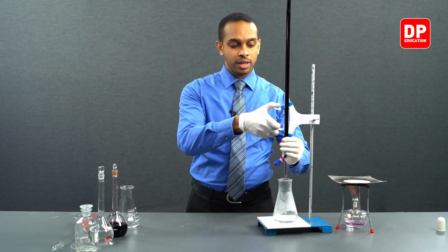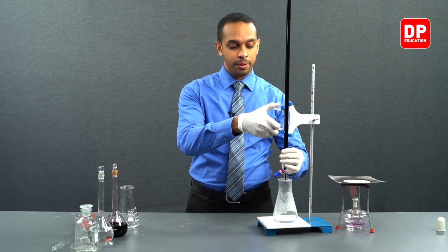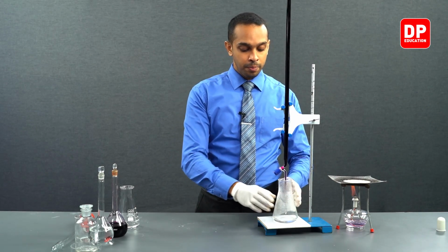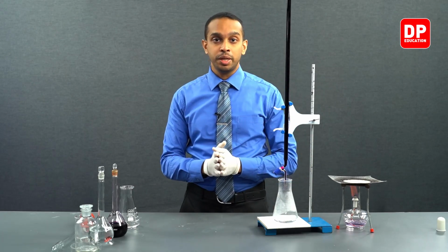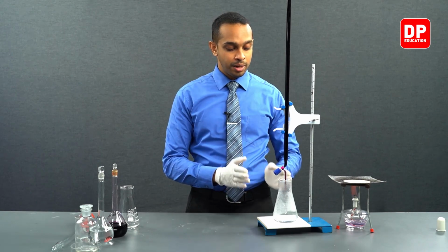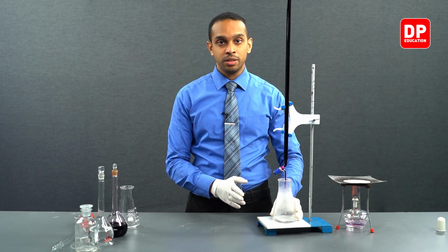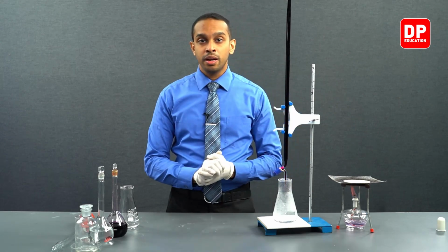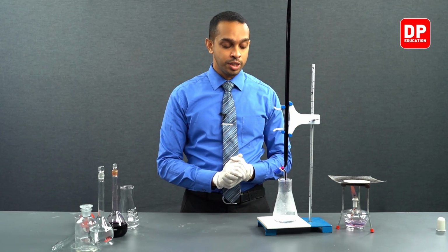So let's move on to our second titration. Just like in the previous titration, we have heated up our solution, and if we need to heat it up in the middle, we will go ahead and do so. For the time being, it is at a temperature of around 60 to 70 degrees Celsius. So now let's start our titration.